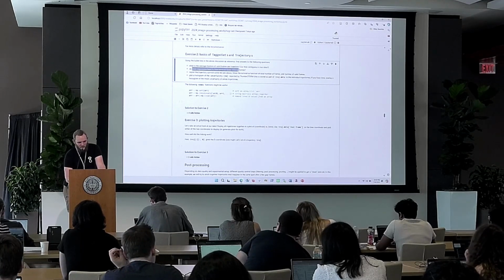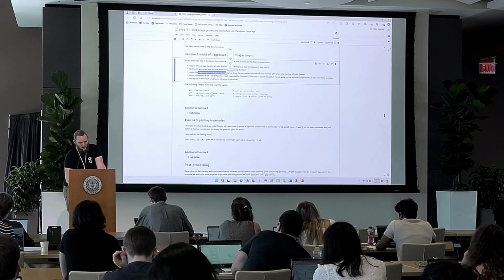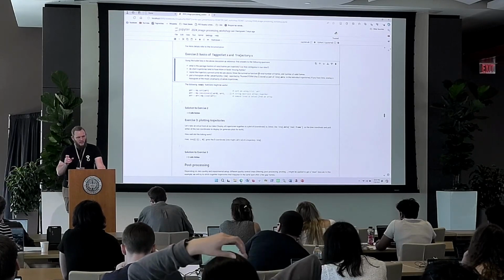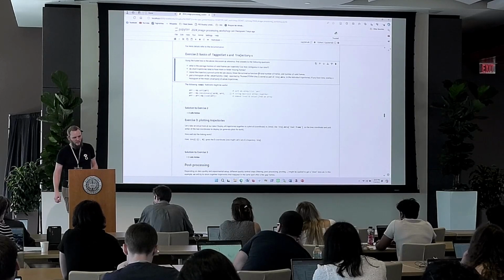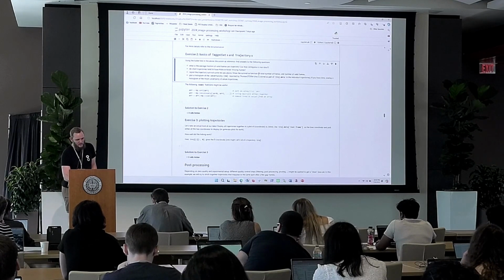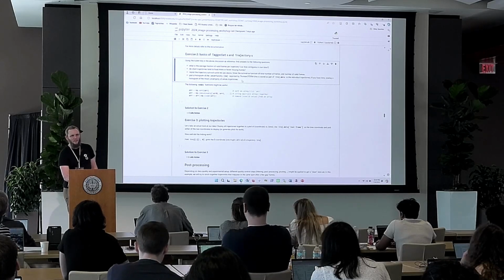Are short trajectories better or worse on this? You can plot the survival curve and compare, if you plot the survival curve as a function of the number of valid frames in the trajectory, so localizations that are actually there, or as a function of length in the trajectory, so how much time the trajectory spans. And the final one here is to plot a histogram of the uncertainty that thunderstorm reports.